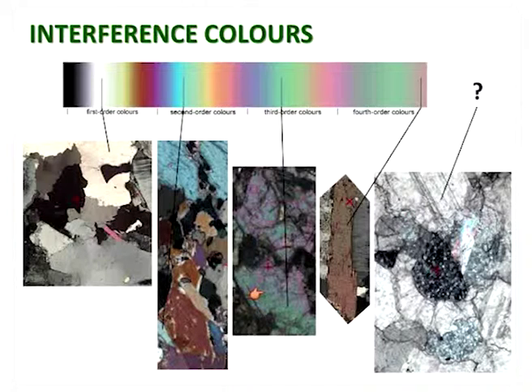Biotite shows colours which are very strongly confused or masked by its brown colour. In fact, this one here shows this effect least because this biotite crystal is running north-south. We'll come back to that later, but that means that in plain polarized light it would have a very pale colour. And so the interference colours for once show up quite nicely.